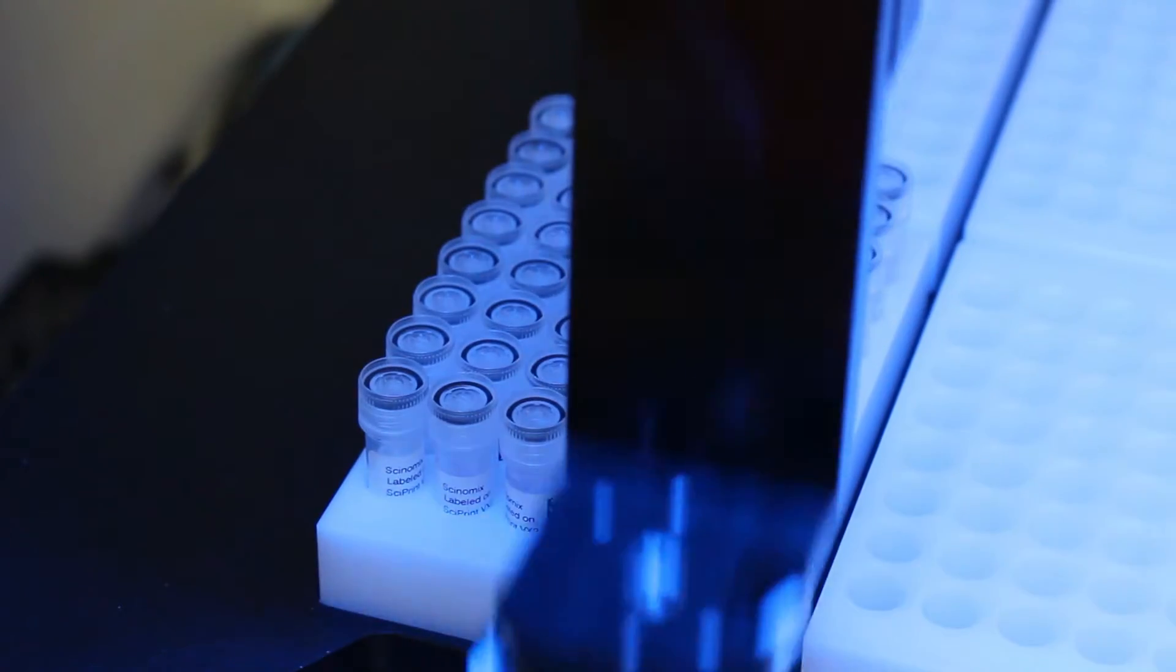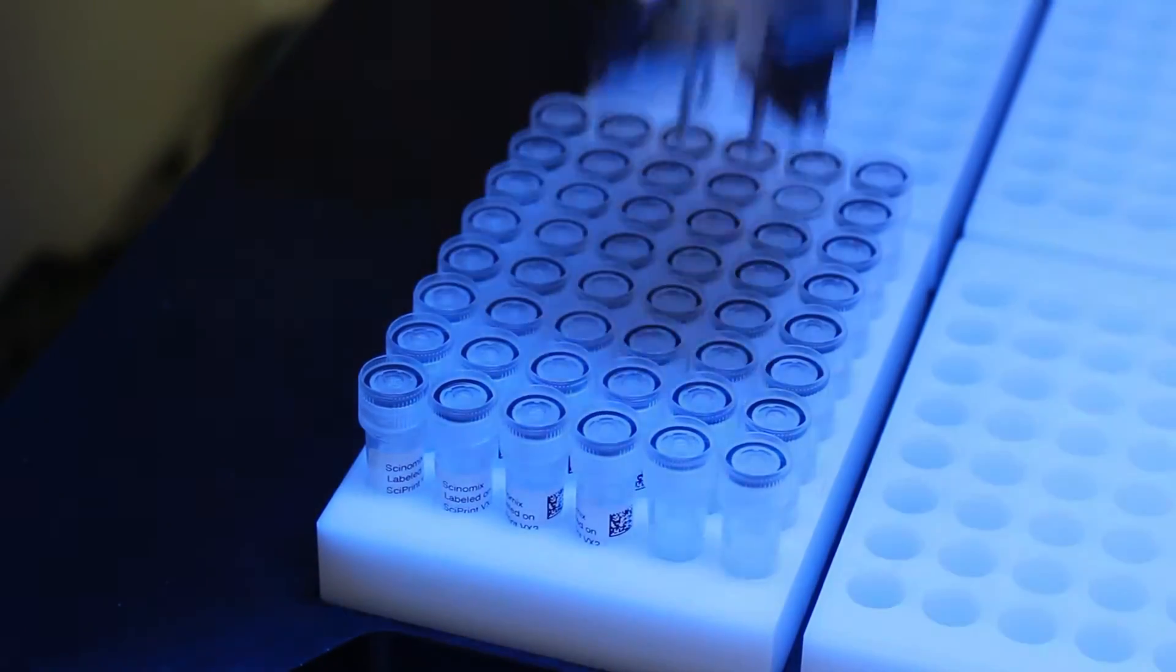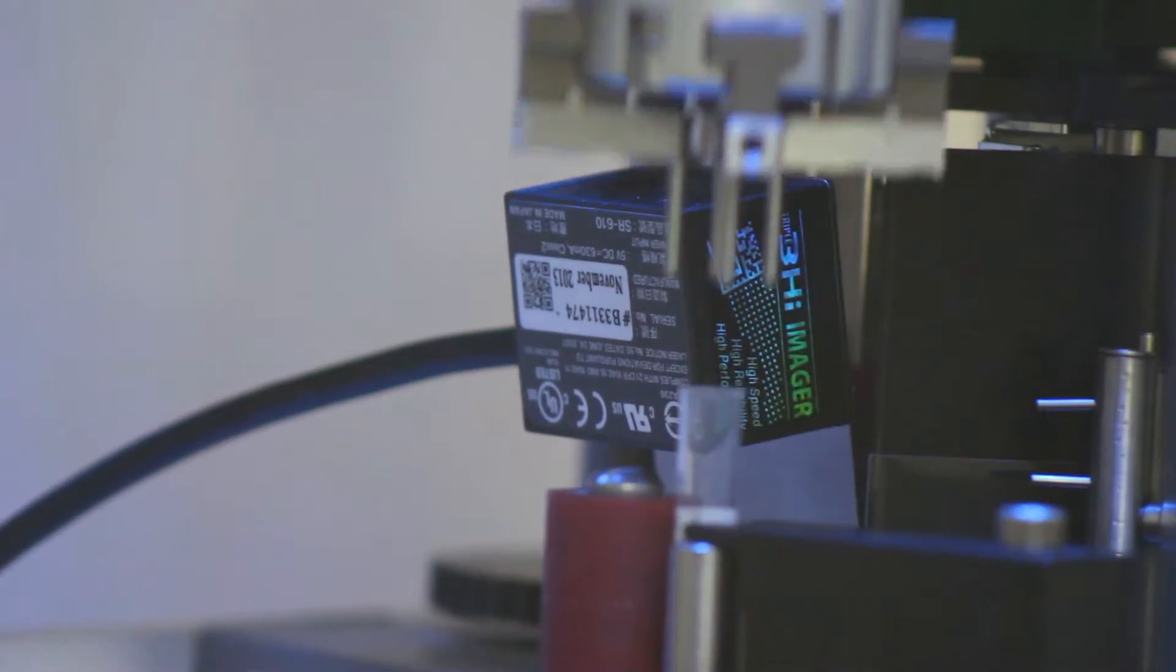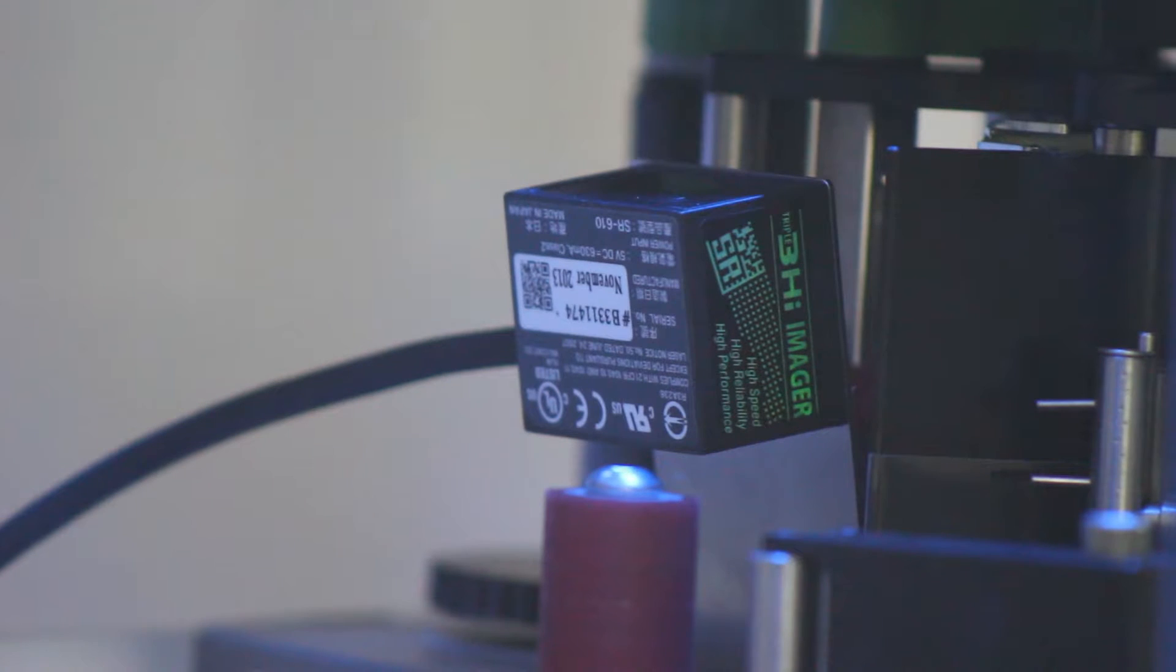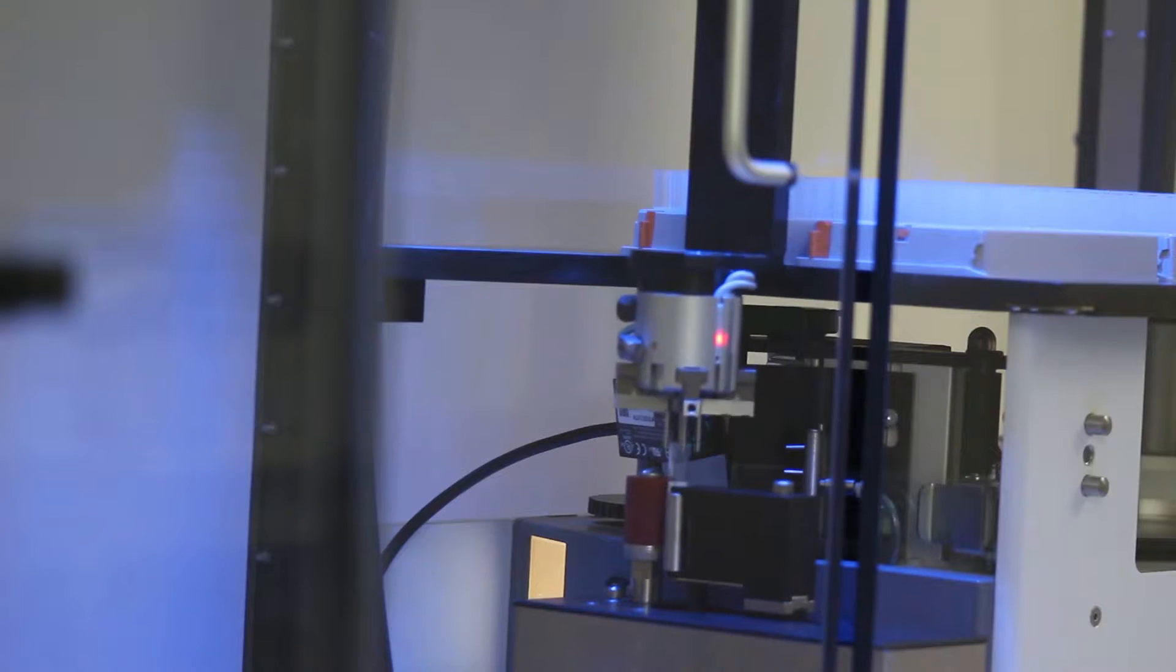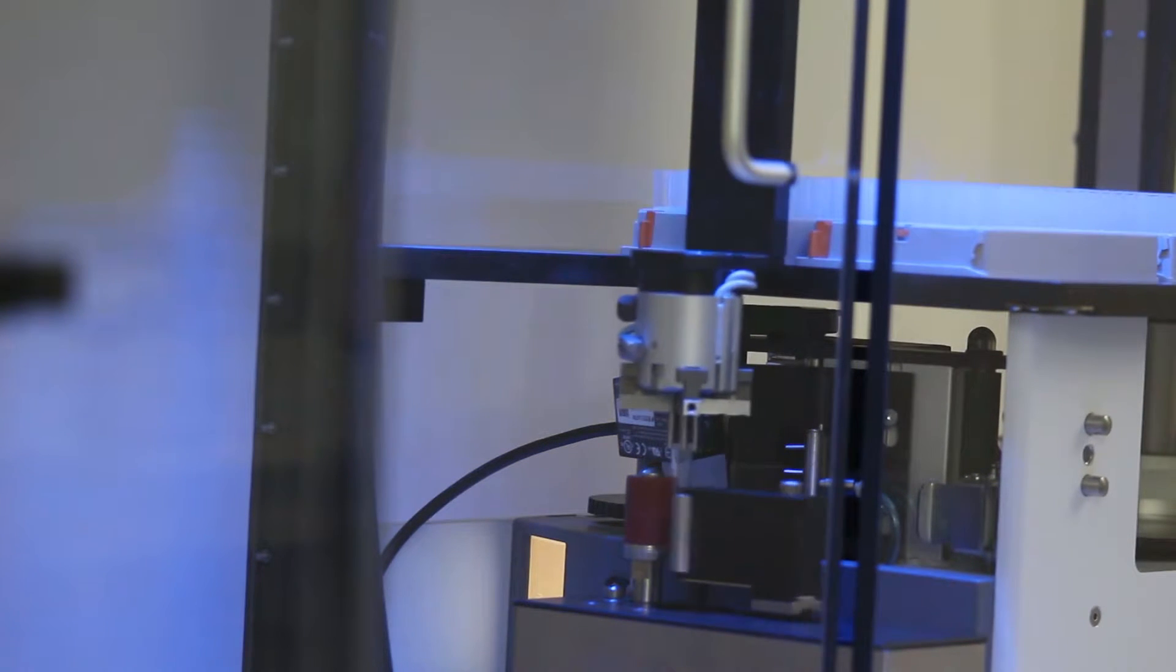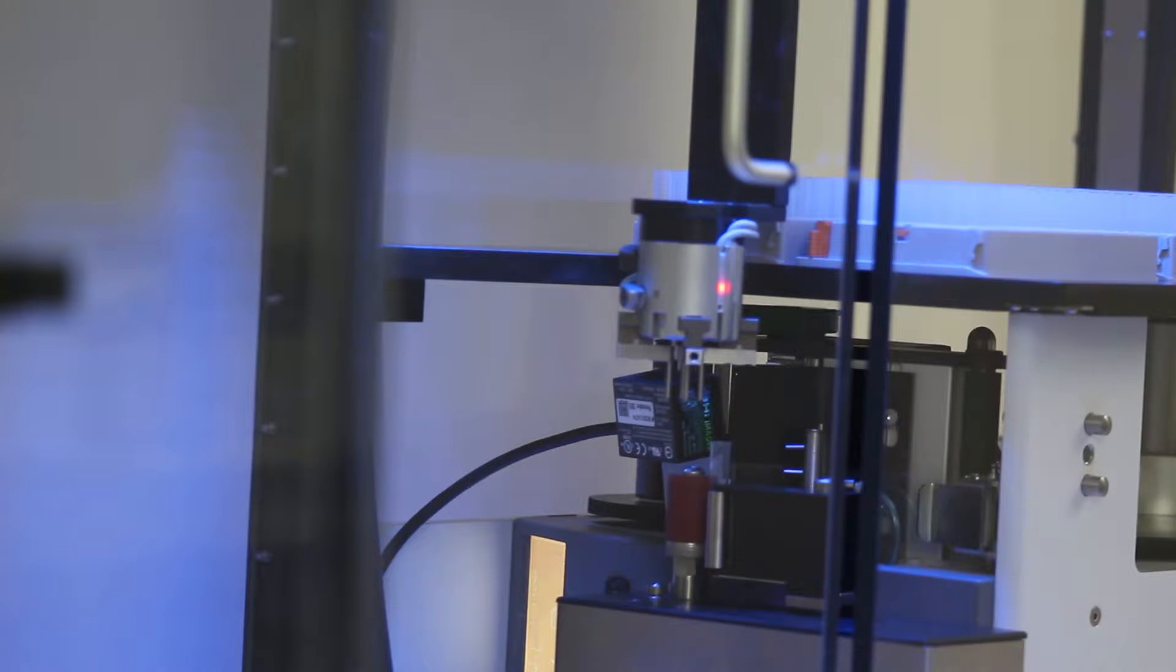In addition to vial labeling, Synomics offers optional features to accommodate your specific application. An optional 2D barcode scanner can be attached to the system to be used in one of two ways. The scanner can read the underside of matrix and micronic-style vials, which is useful for data lookup, or it can be used for validation of the printed label.